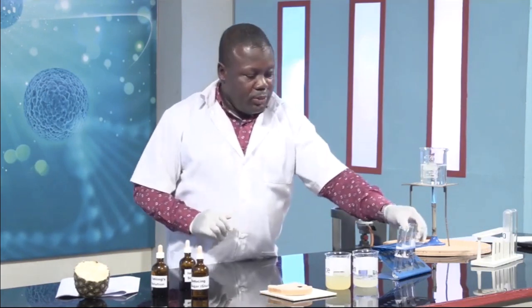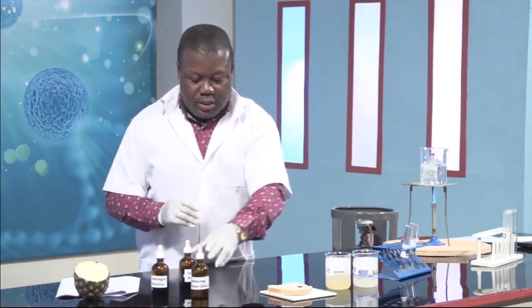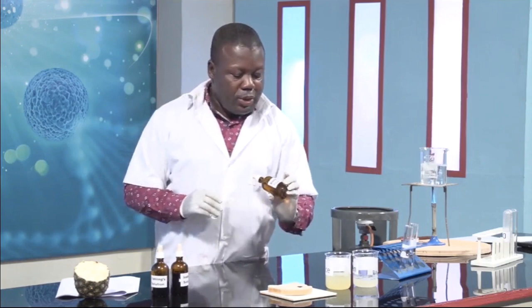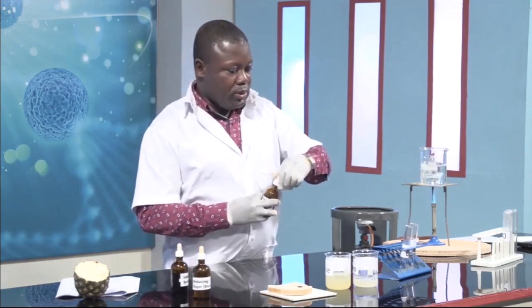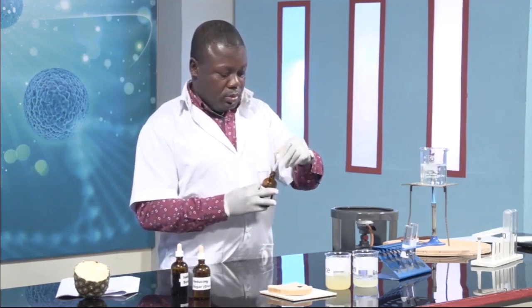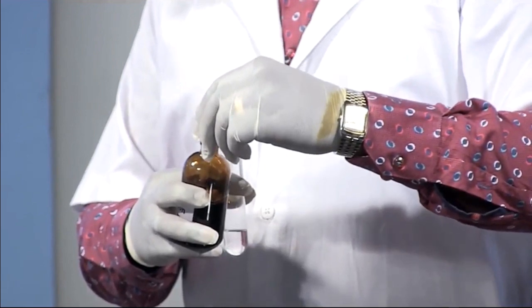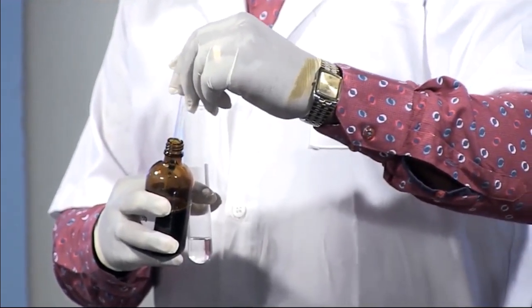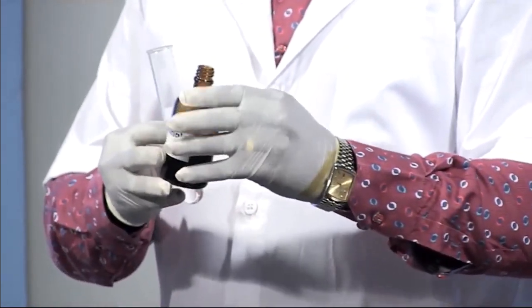Then we add 2 cm cube of the Fehling's solution, which I've already shown on screen, to each of the test tubes A, B and C. So we'll take the same amount, 2 cm cube.